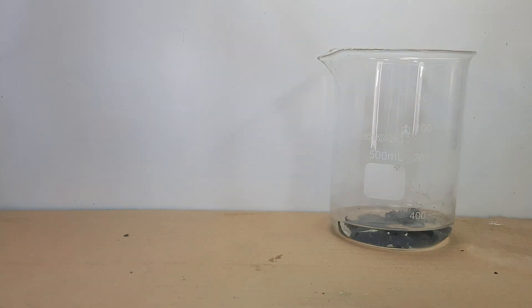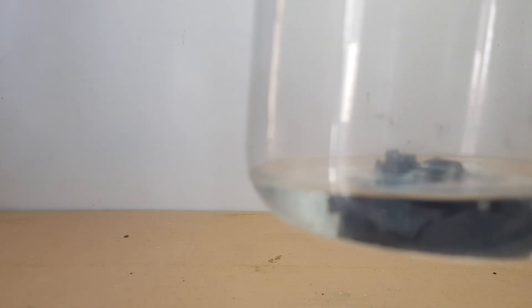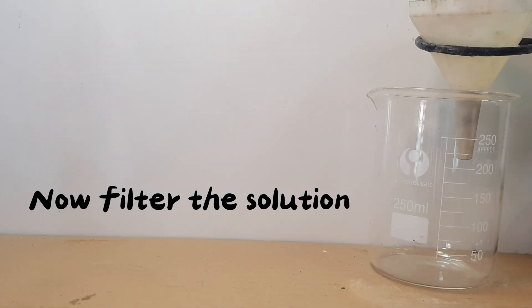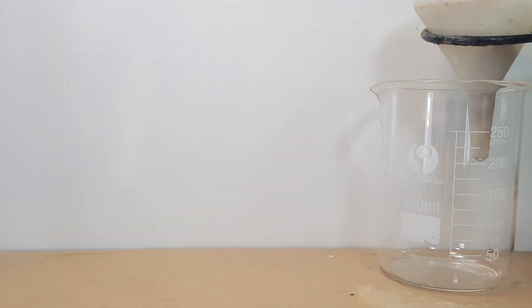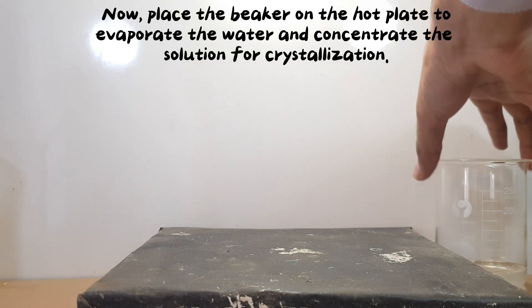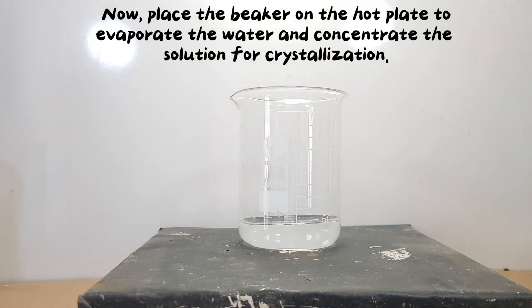The next day, place the beaker on the hot plate to evaporate the water and concentrate the solution for crystallization.